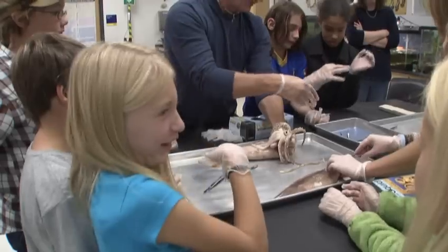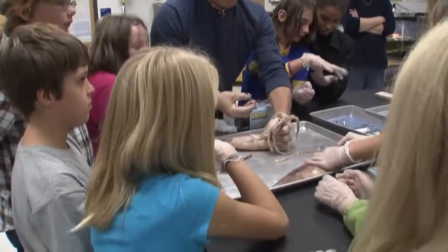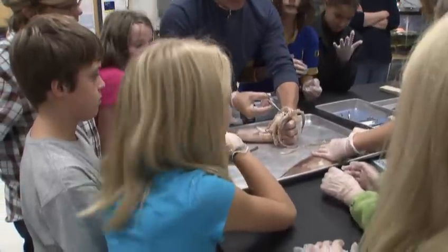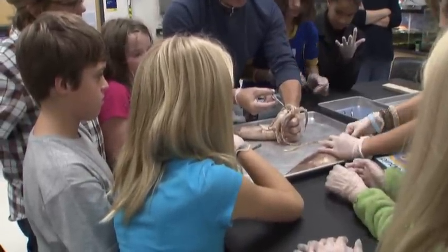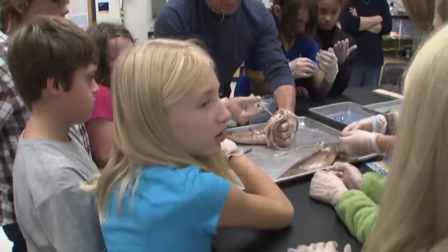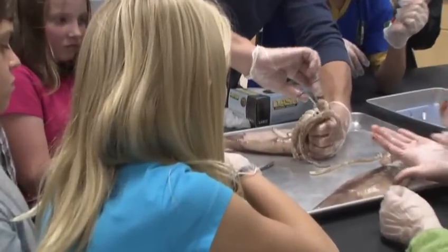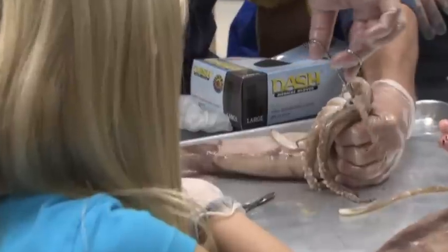This is kind of a gross part, but my students love this part. Yeah, this is very interesting. This is like a funnel that overshadows this beak. You see the beak right there? It's like a bird beak, like a parrot. So I'm going to pull this whole thing out because this leads to the esophagus down below. So it takes a bit to cut this thing out.